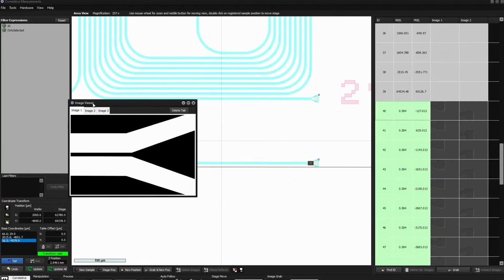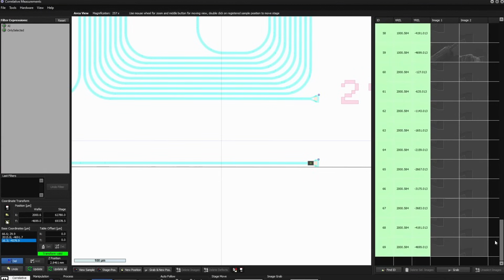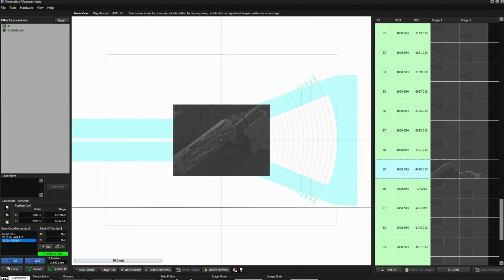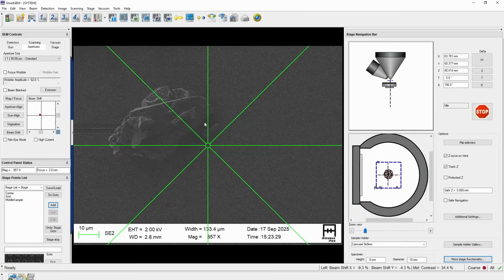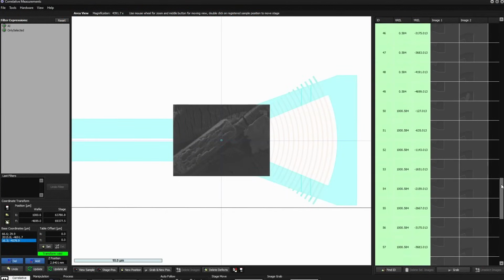Okay, everything is finished. And we have a list of acquired objects here. This here seems to be a little bit distorted. We can have a look at that if we move there. Yeah, we are here. And when we look at the SEM, we can see there's a huge particle there. That's why the cross-referencing doesn't work, but all other positions seem to be okay.